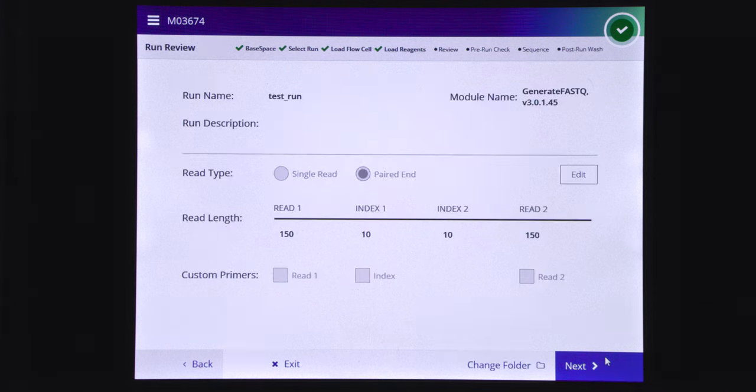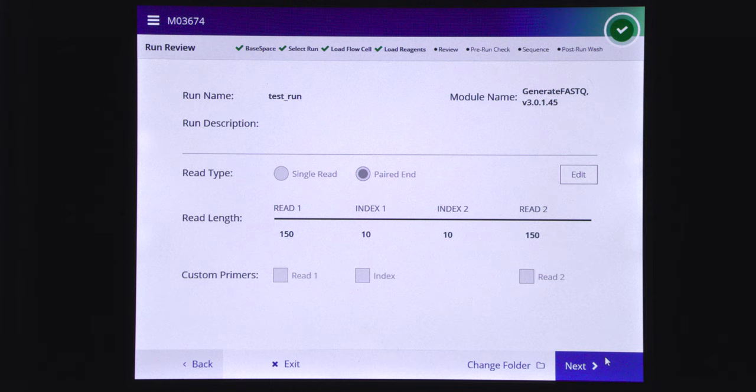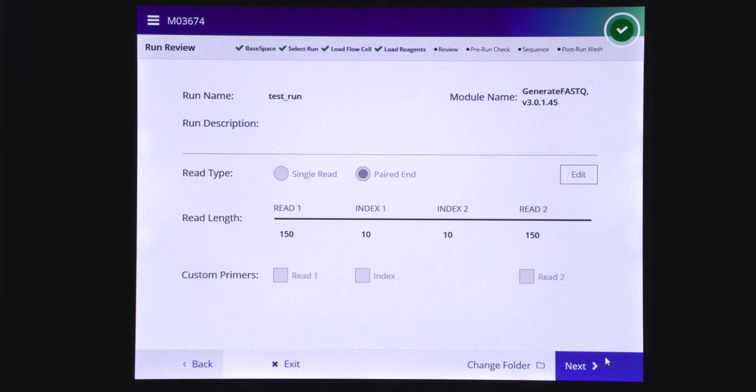Review the run parameters including experiment name, module name, read type, read length, and custom primers. These parameters are specified in Local Run Manager or in the sample sheet.